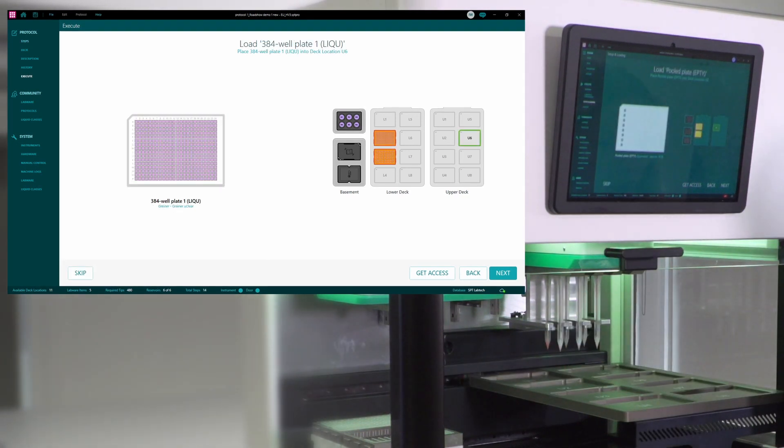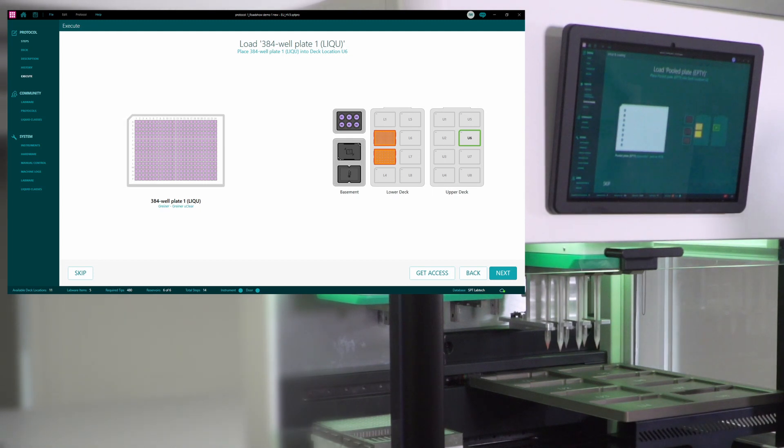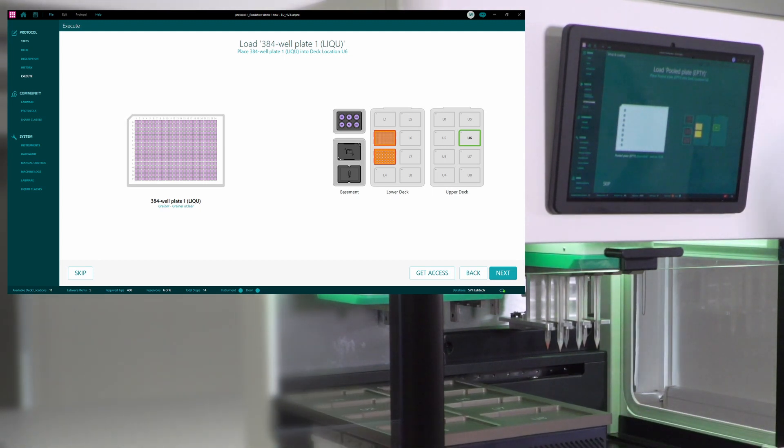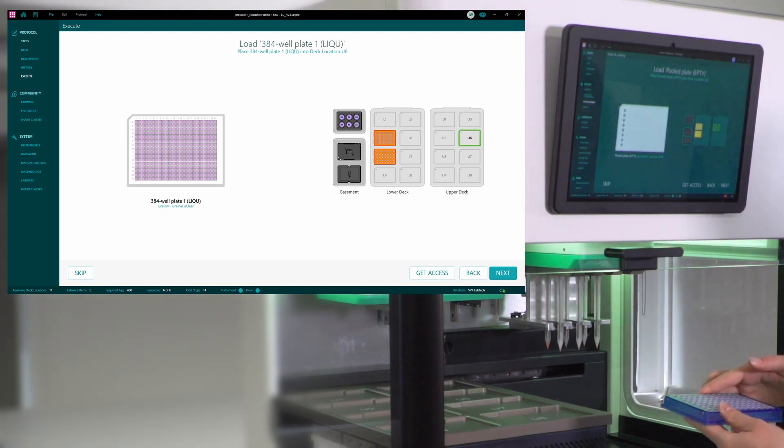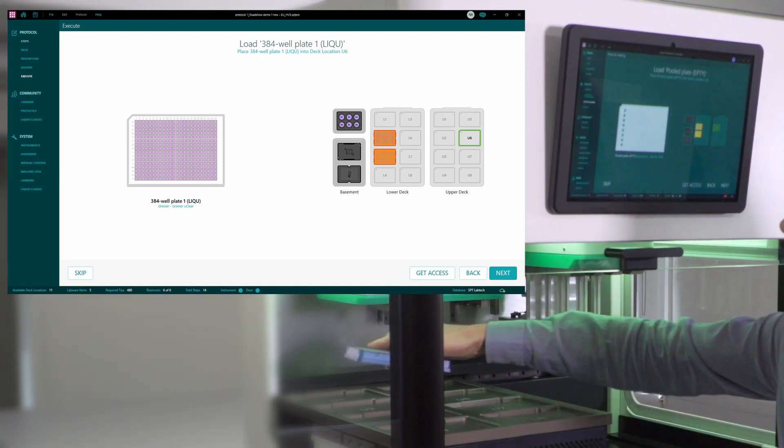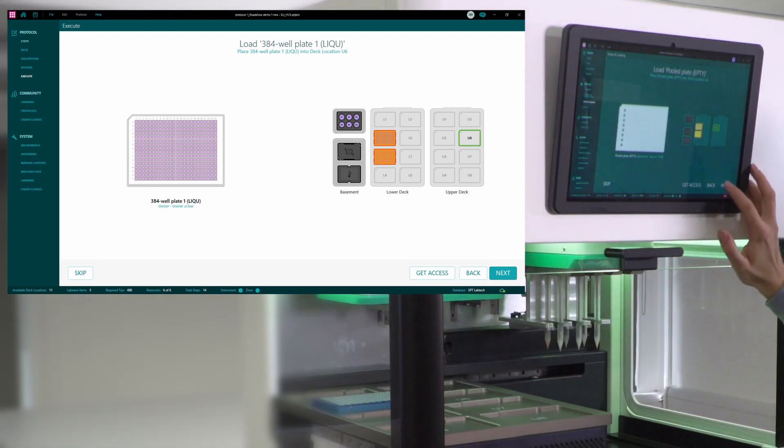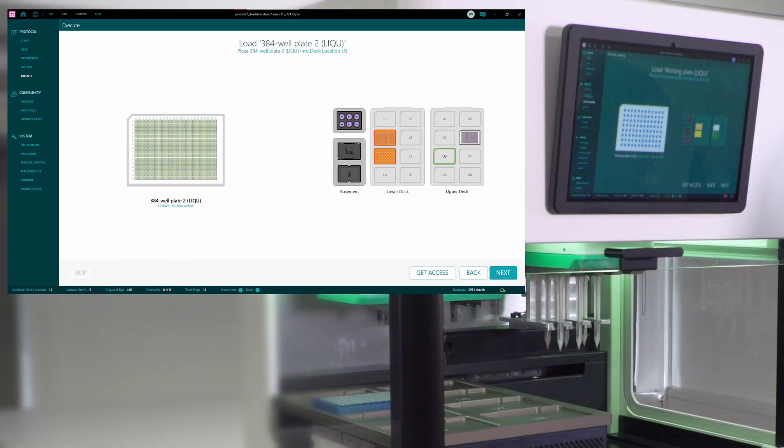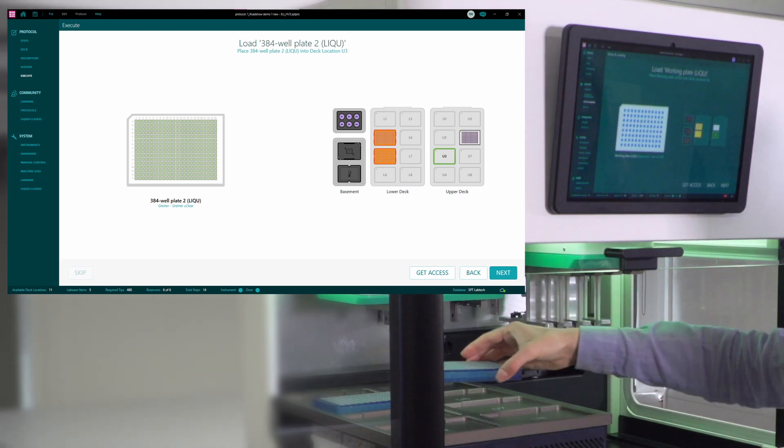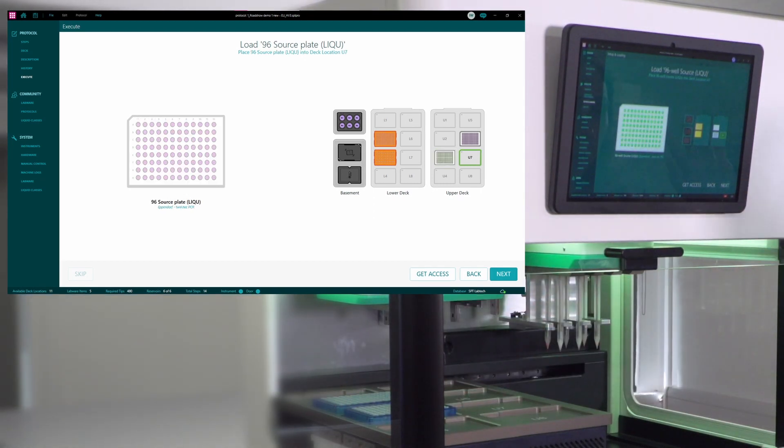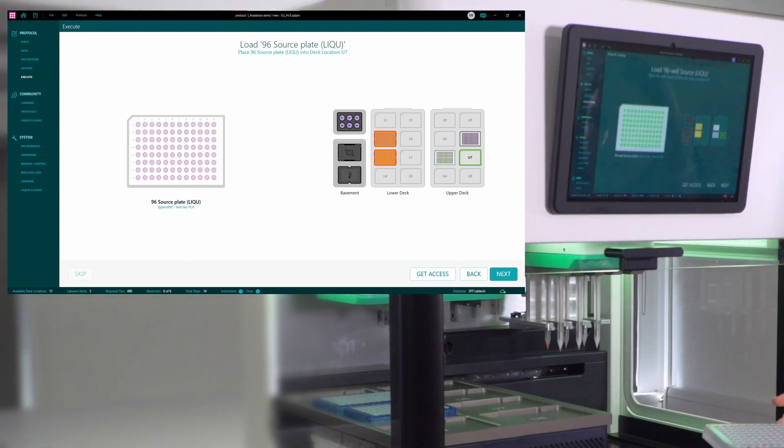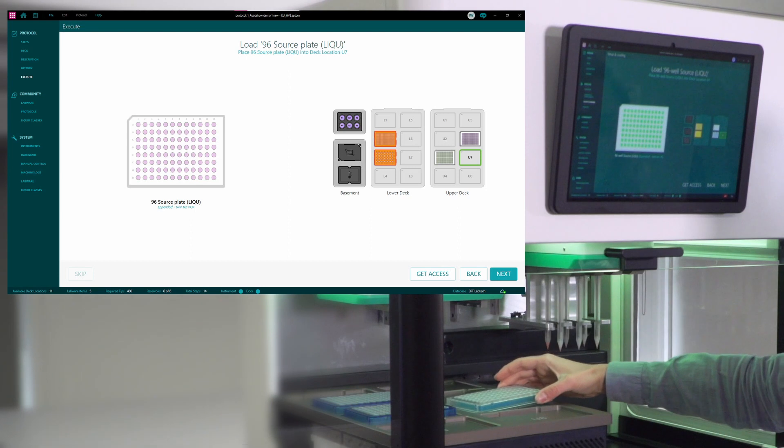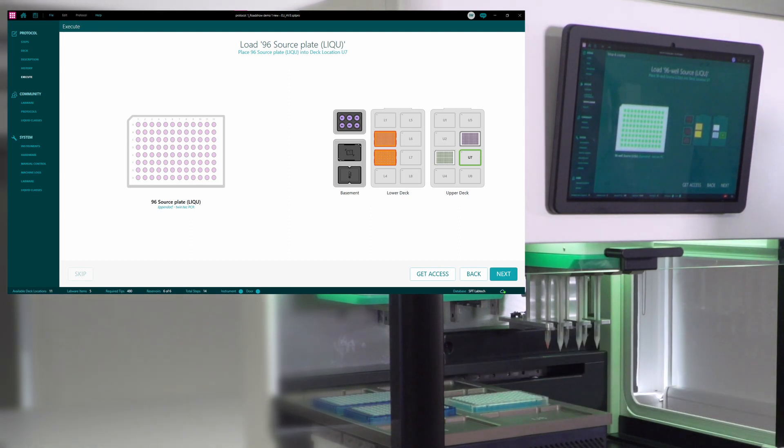And I will proceed to load the plates. The plates are going onto the upper deck. And I will start with the empty plate in position U2. And then I will move into the next empty plate into position U3. And the last one to load is the plate with my sample. It's a different 96-well plate in position U7.